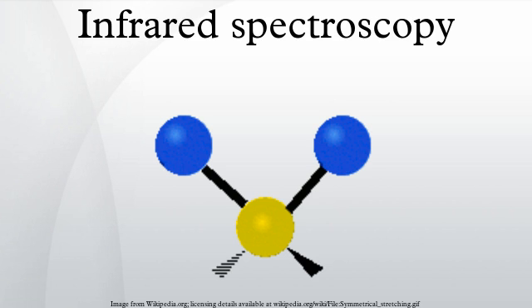FTIR. Fourier transform infrared spectroscopy is a measurement technique that allows one to record infrared spectra. Infrared light is guided through an interferometer and then through the sample. A moving mirror inside the apparatus alters the distribution of infrared light that passes through the interferometer. The signal directly recorded, called an interferogram, represents light output as a function of mirror position. A data processing technique called Fourier transform turns this raw data into the desired result, light output as a function of infrared wavelength. As described above, the sample's spectrum is always compared to a reference.